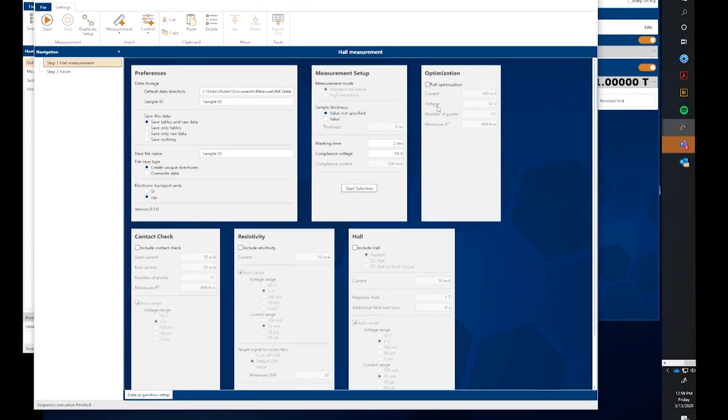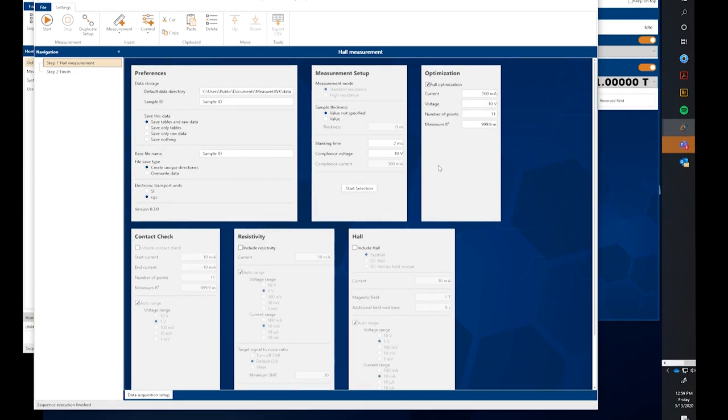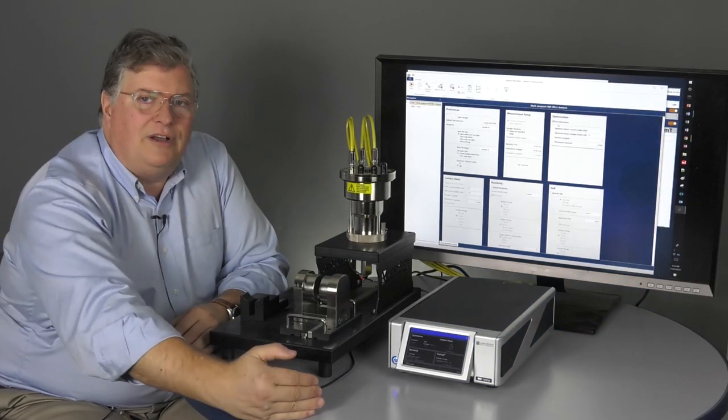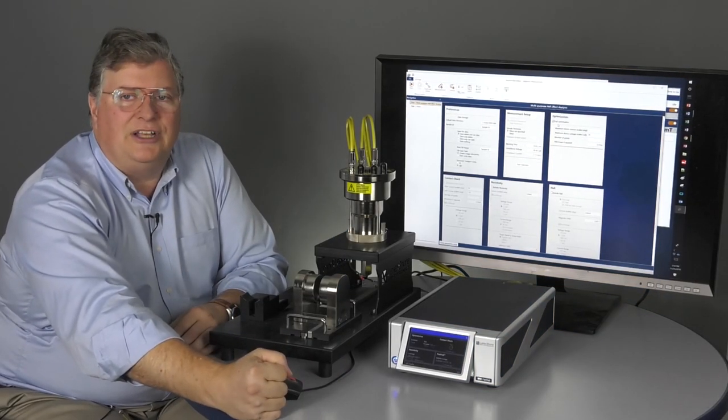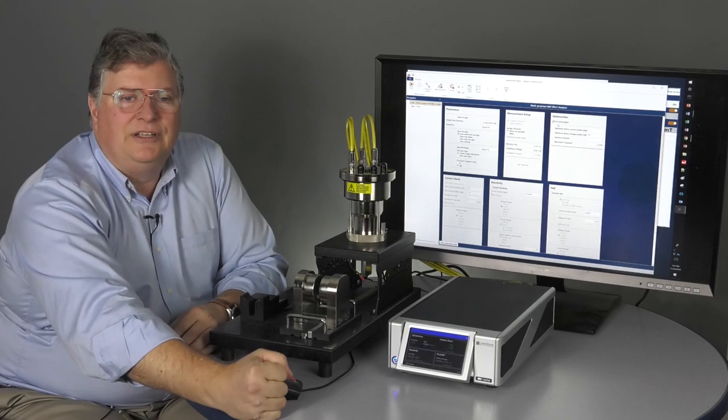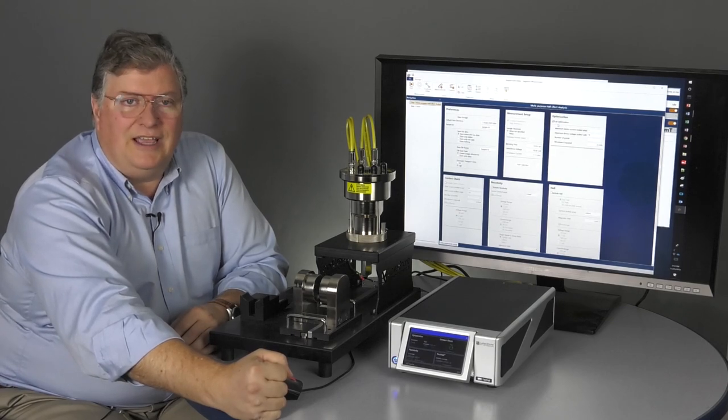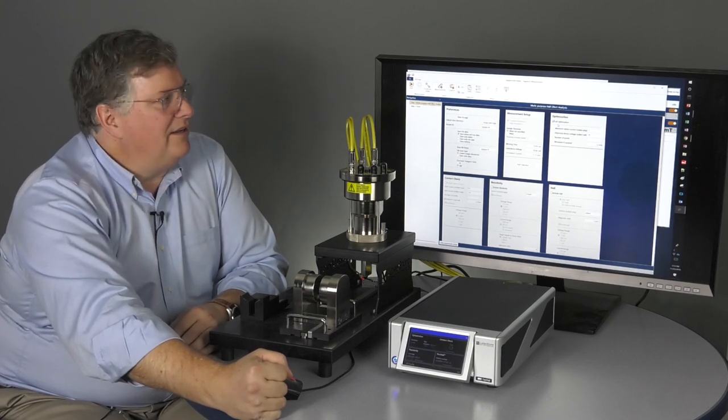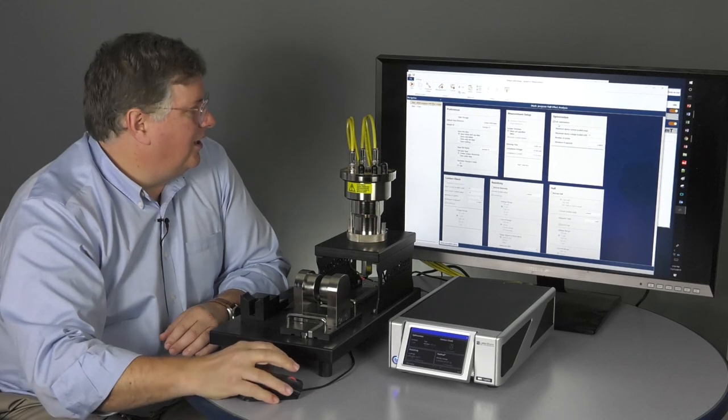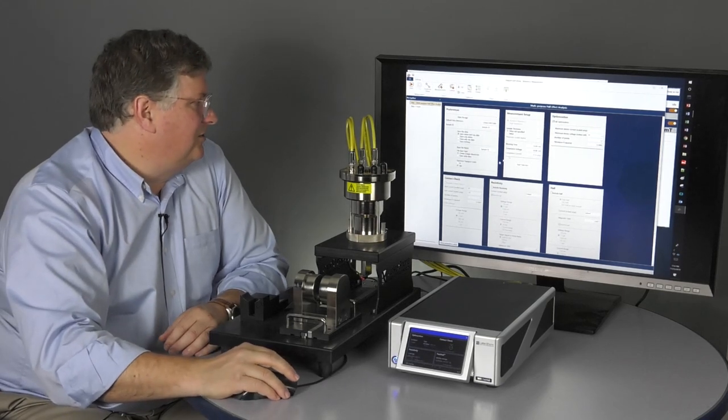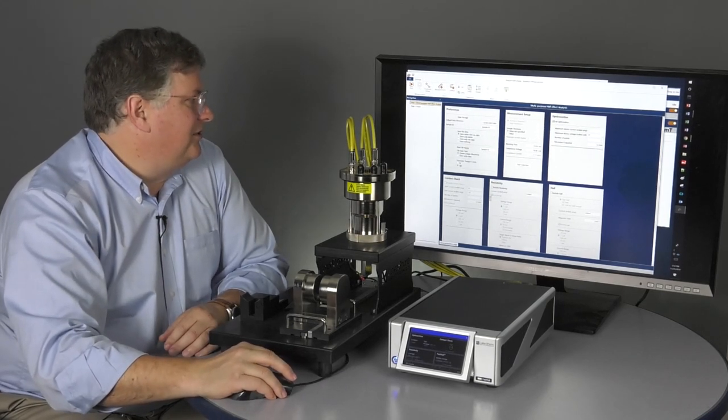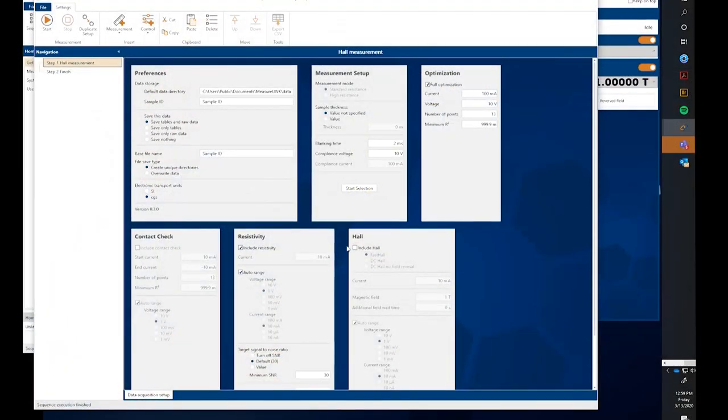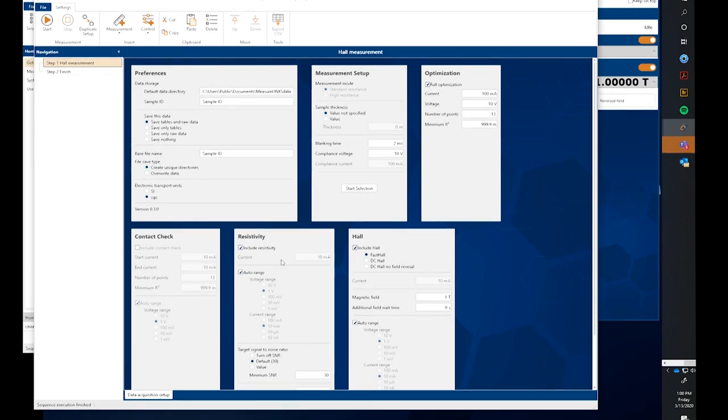The very nice properties of the M91 and therefore this tabletop system is the ability to optimize. This means we don't have to specify an excitation current. It will select, it will run a number of contact checks and allow us to optimize and select an excitation value for us. Then also, I'm just going to select resistivity and the hall.